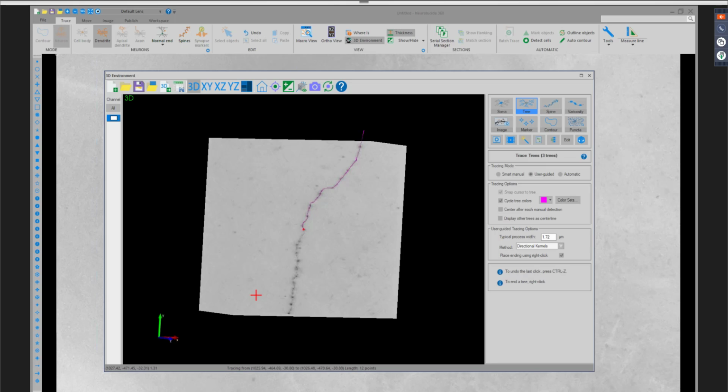But you'll notice if I rotate here, I apologize for the confusion there. As I was going down, I made it to the edge of the boundary. And then it's actually pushed back our subvolume. So it is going to be moving that boundary in Z for us as well and having a nice continuous tracing for us.